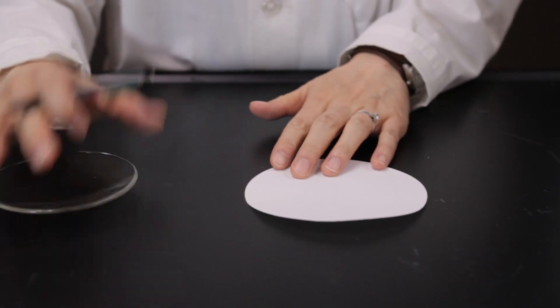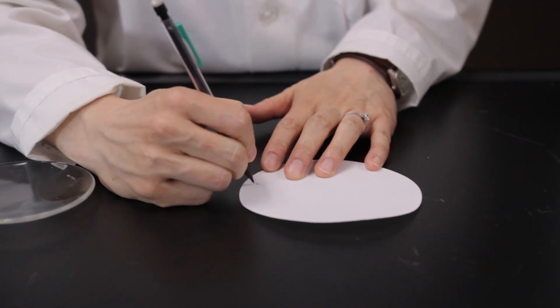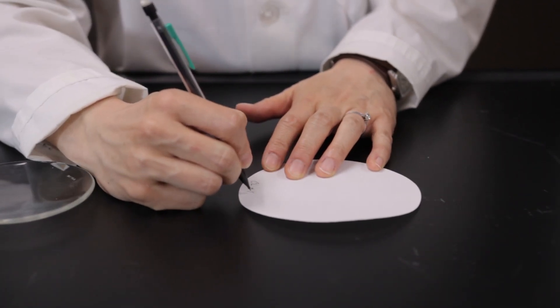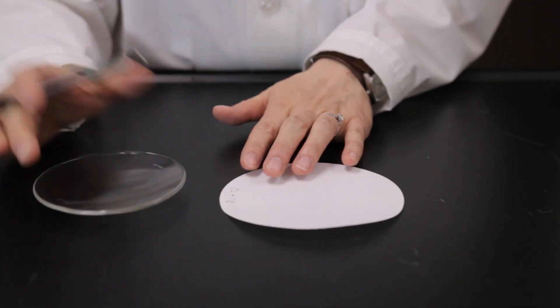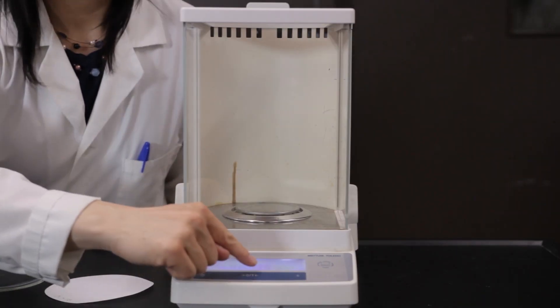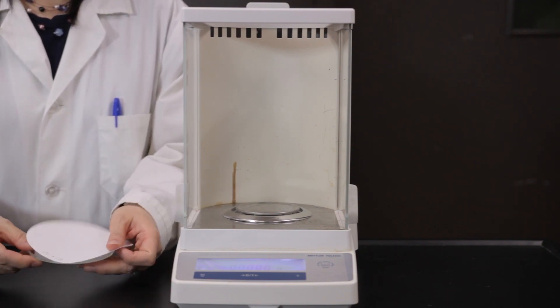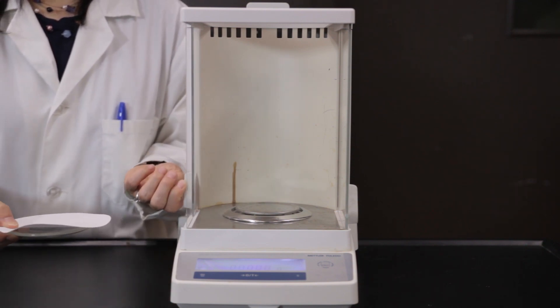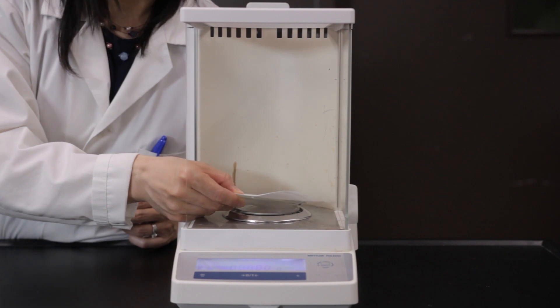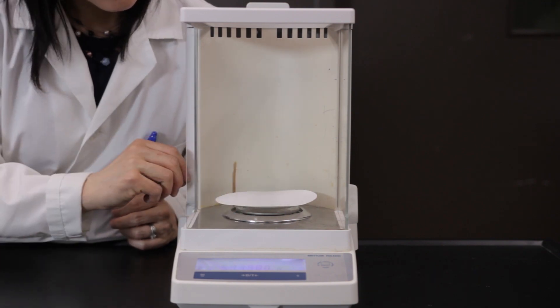Label a dry filter paper with your initials using a pencil along the edge. Place the filter paper on a watch glass and weigh them. Record the exact mass.